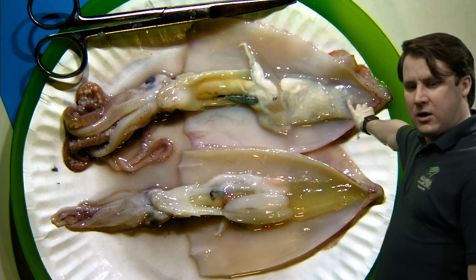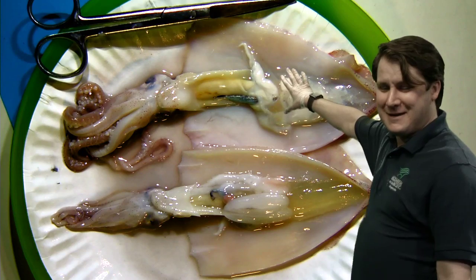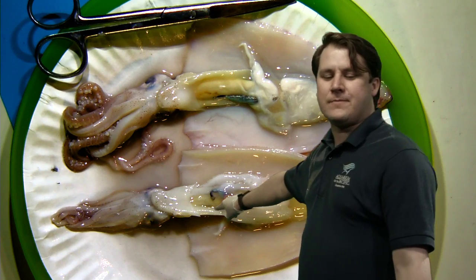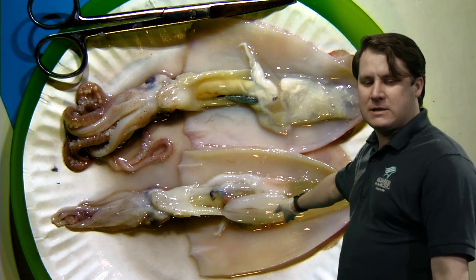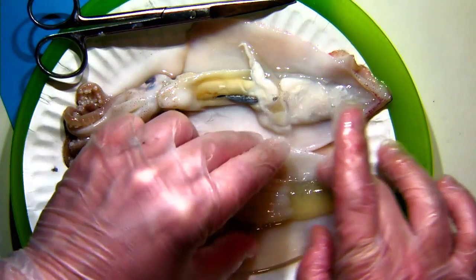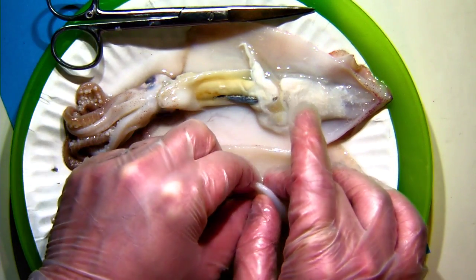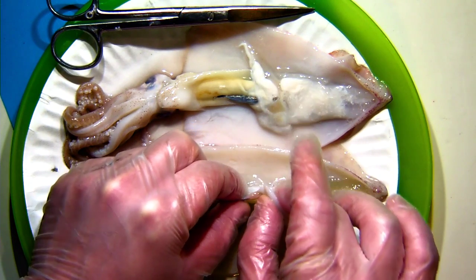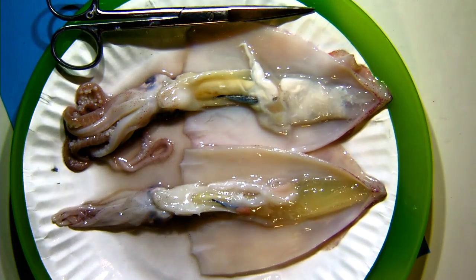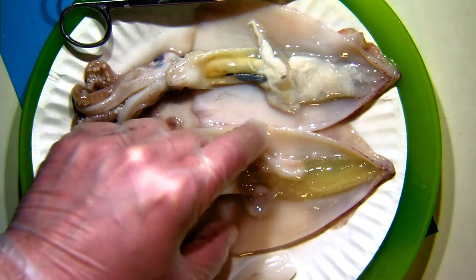You might have guessed it — this yellow sack that's jello-like in its texture is an egg sac. The squid on the bottom is a female; the one on the top is a male, and that gooey sac up there is a sperm sac. The nidamental glands are structures that produce a sheathing that goes around the egg sac as it's laid. I'm going to lift away the nidamental glands on the female — they're just held in place by some sticky tissue. Underneath, we can see she also has an ink sac, just sort of buried there, plus some stomach contents.